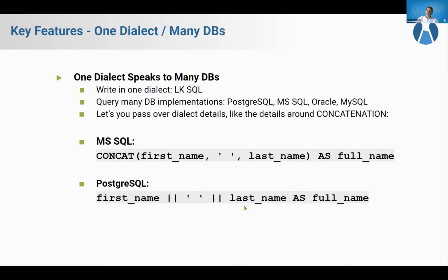Another great advantage is by speaking LabKey SQL, you really get to speak a bunch of other SQL dialects without even knowing it. That's because LabKey SQL automatically translates your query into Postgres dialect, Microsoft SQL dialect, Oracle dialect, MySQL dialect, and maybe even some others I'm forgetting. This really lets you sort of forget about these other dialects, which is really nice. And here's just a small example of what I'm talking about.